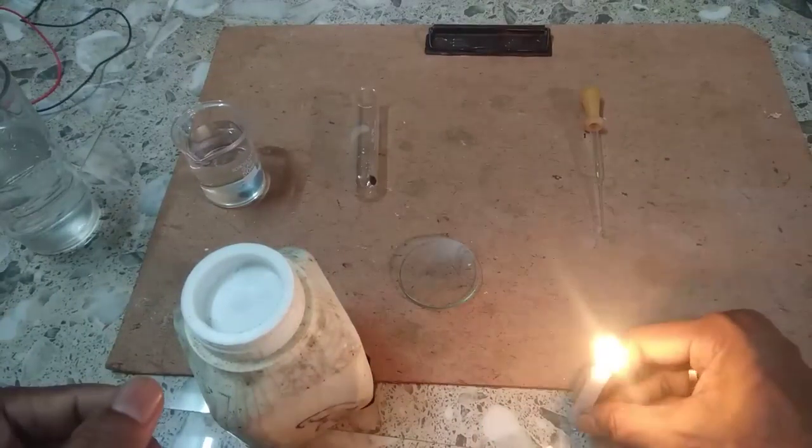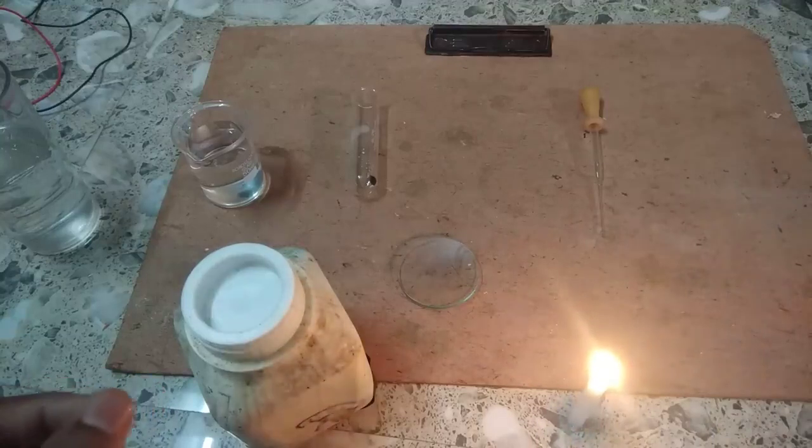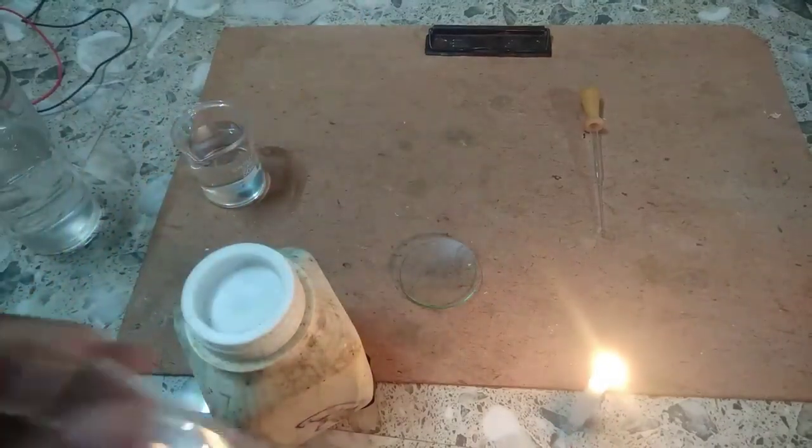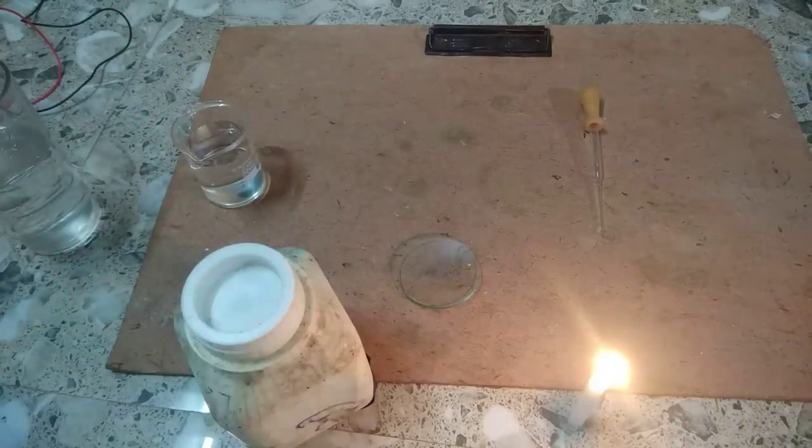Now, we've taken this candle. Take a test tube.